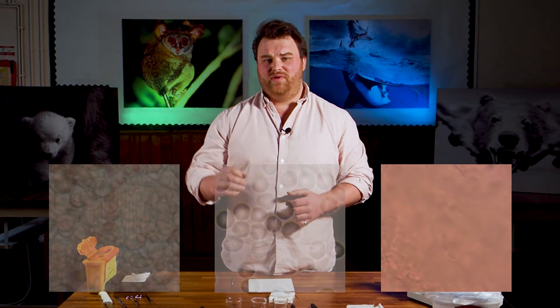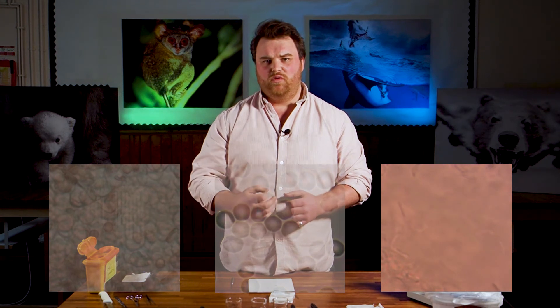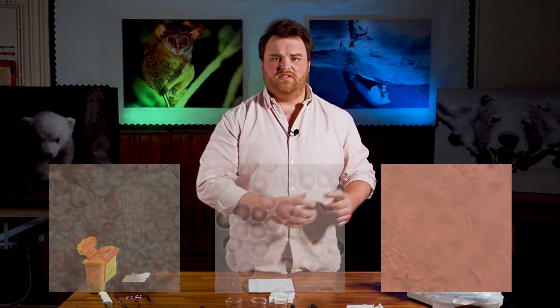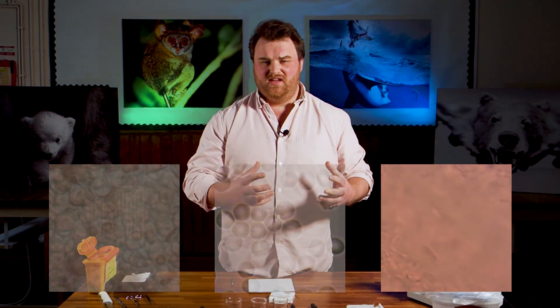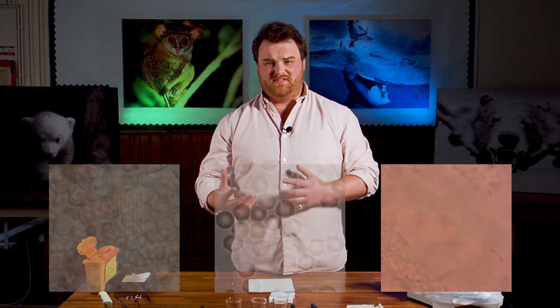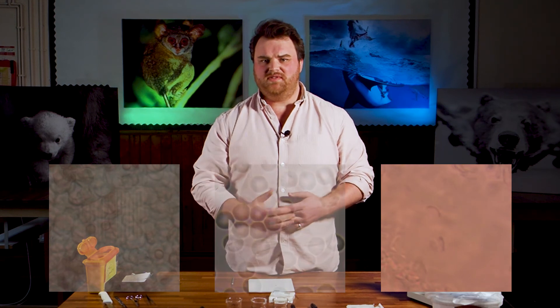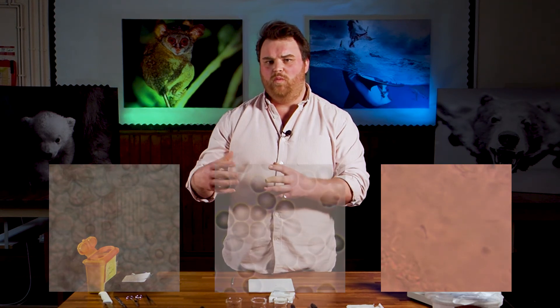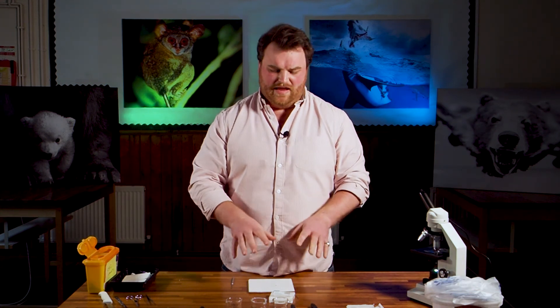On the right hand side you can see those cells have burst — there just aren't as many anymore. That's because the distilled water outside the cell had a higher water potential than the cytoplasm inside, so water moved in. Those cells swelled up and eventually burst. This is what we call lysis, and it's a real problem with putting animal cells into water. Same reason why you hear doctors talking about saline drips to rehydrate people — we don't put pure water into people because it can damage cells. We need to make sure the osmotic balance stays the same, which is why we use that 0.85% isotonic saline solution.